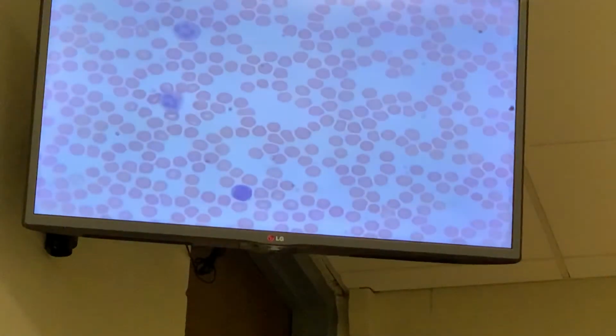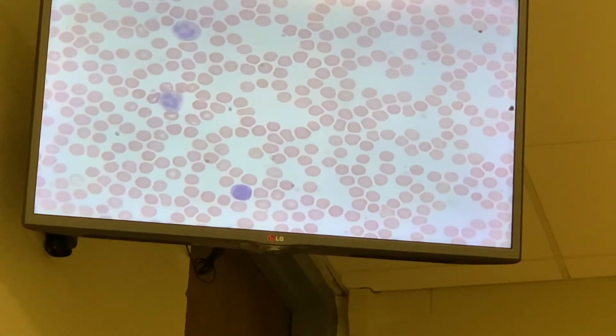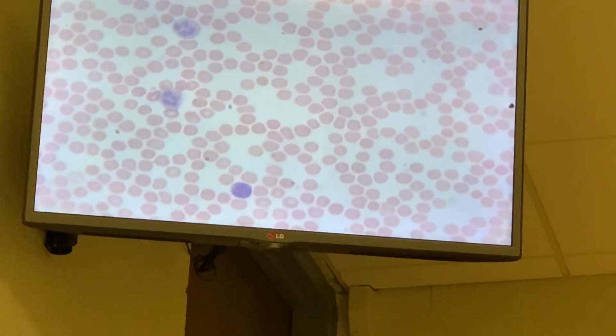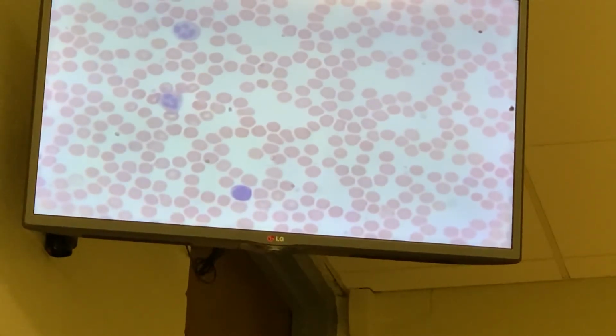I'm going to try to show you another neutrophil, since that image is in your head. So, neutrophil. See, these would be neutrophils. See how the nucleus is all different shapes? And then this here would be a lymphocyte, another lymphocyte.